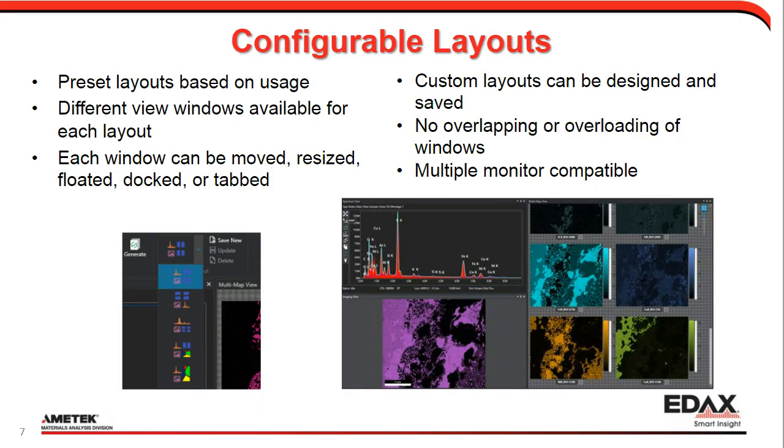The layouts are completely customizable. There are multiple preset layouts based on usage for each mode. Different view windows are available for each layout. The left picture shows the layout drop-down menu on the ribbon bar for mapping. There are 5 layouts to choose from.